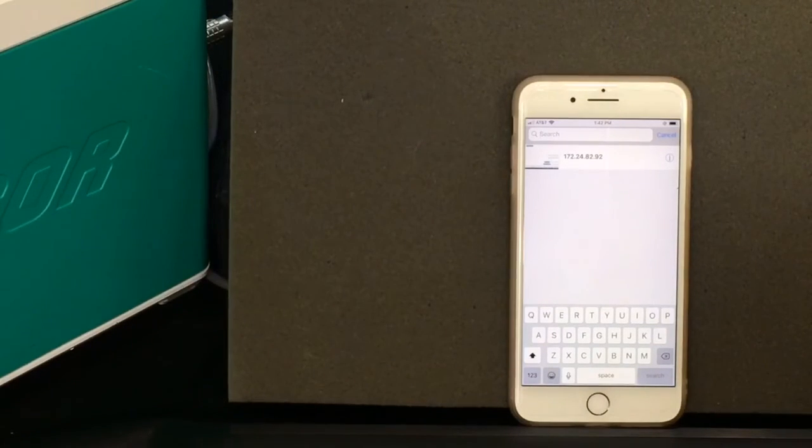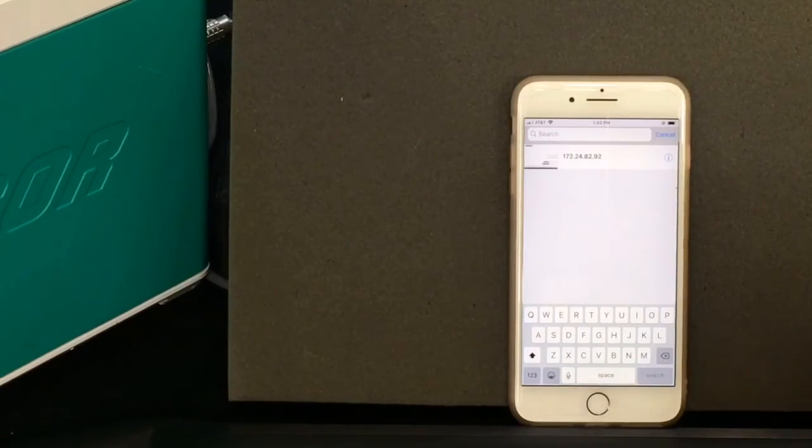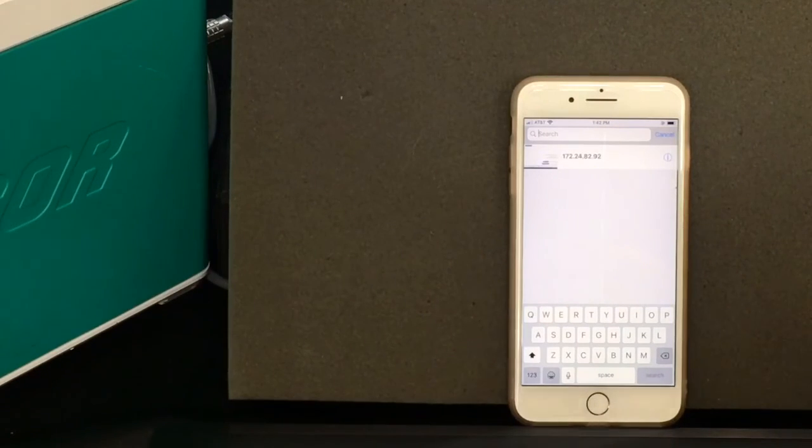In that case, you can see a very teeny cursor. Make sure that cursor is positioned on the button you want to control. Then tap down on the screen. Otherwise, you are not able to control that screen.